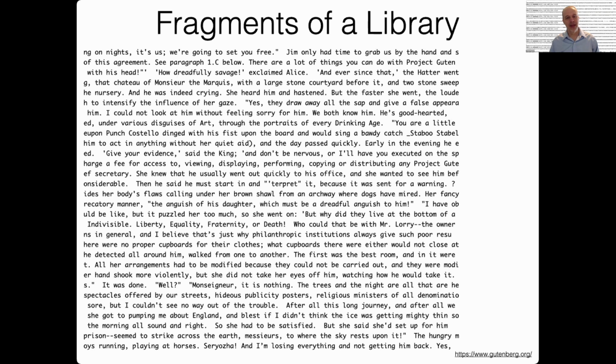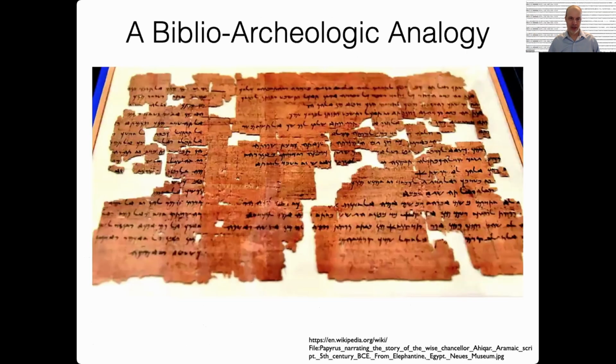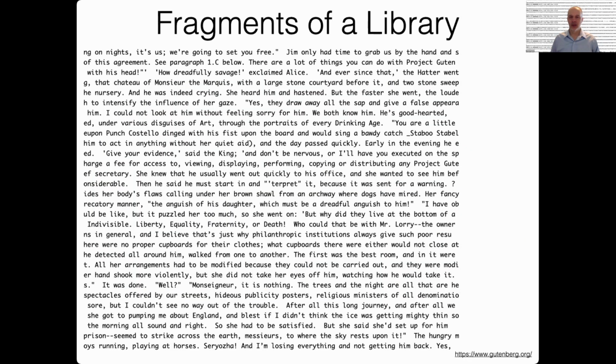So just to simplify things, we're going to assume that the fragments are continuous lines because it's a lot harder to work with these irregularly shaped fragments. So imagine that we got lucky and the books just happen to fragment as whole lines. And also to simplify things, each of these lines here is a separate fragment. And lucky for us, they all happen to be 100 characters long. And when I say 100 characters, I'm counting spaces and punctuation as characters.